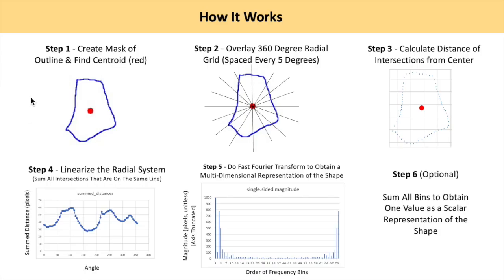Before we move on, let's quickly discuss how ShapeGenie works. For example, in step one, if this blue object represents the outline of the shape you want to measure, then you can apply what's called the radial grid system, which is centered at the origin, this red dot, which is the middle of the bounding box surrounding your shape. And then from there, radial lines emanate in 360 degrees, which allows you to find every intersection of the radial lines with the edge of your object. This allows you to calculate the distance of each of these dots to the origin, producing the results in step four. And after this, you apply the fast Fourier transform on this complex sinusoid wave to get a frequency spectrum that represents the original shape that you began with.